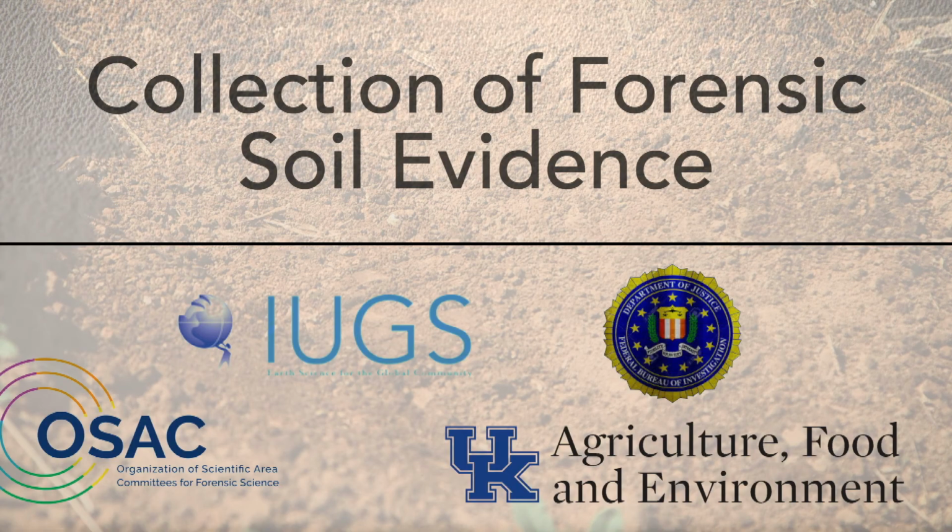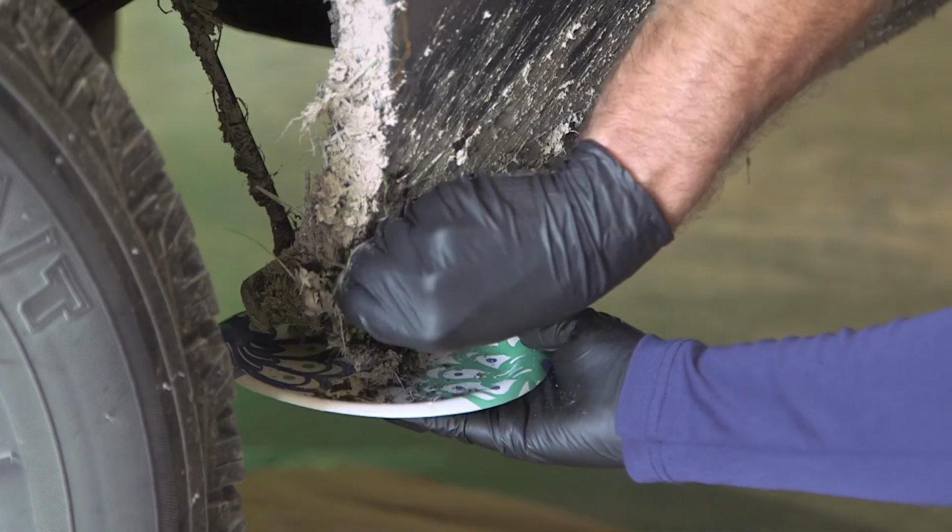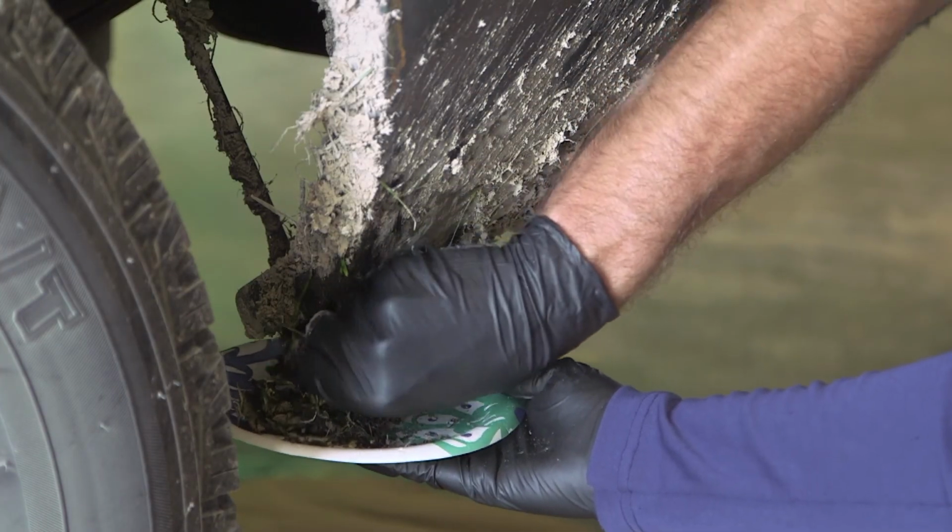This video is intended for evidence recovery personnel to assist them in the collection and preservation of forensic soil samples. I'm Jody Webb, a geologist forensic examiner at the FBI laboratory. We also include in this video a brief introduction into soil variability and its causes, as well as the role of geology in search strategies. This video is not intended to supersede your agency's policies or procedures.